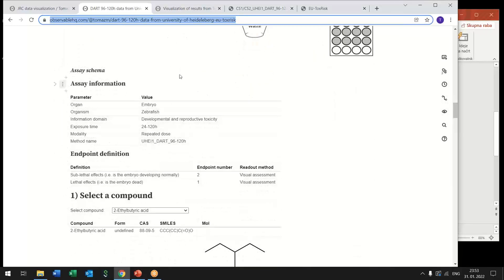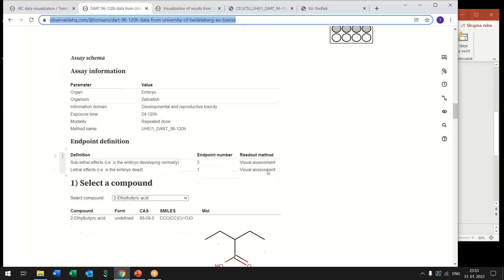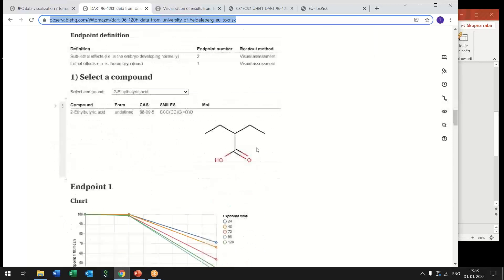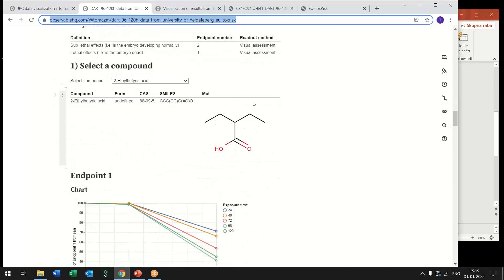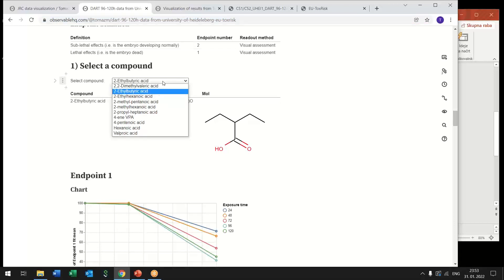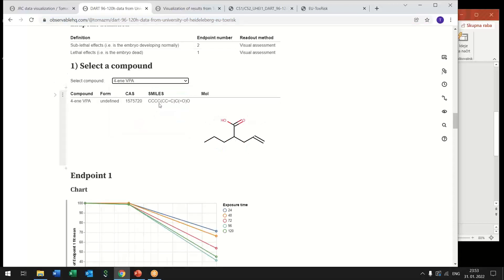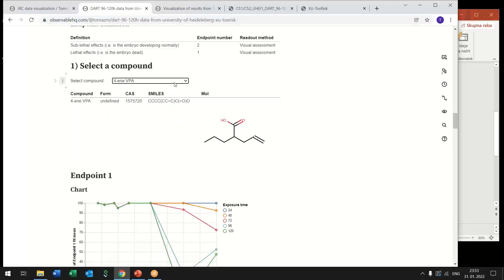And then we get metadata information also coming directly from the database so if it changes there it will also be updated here and after that we get to the user interface so user can now select the single compound.